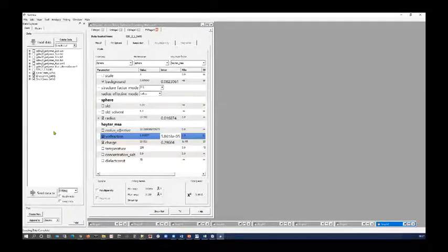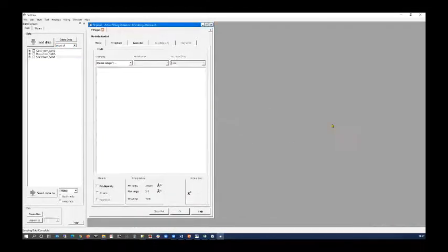So I'm going to send those data sets to fitting. Actually, before I do that, let's clean things up a bit. I'm going to unselect everything, select all, keep all microemulsions and delete everything else. There we go. I can select everything, send that to fitting, and I've only got 3 fit pages to worry about.